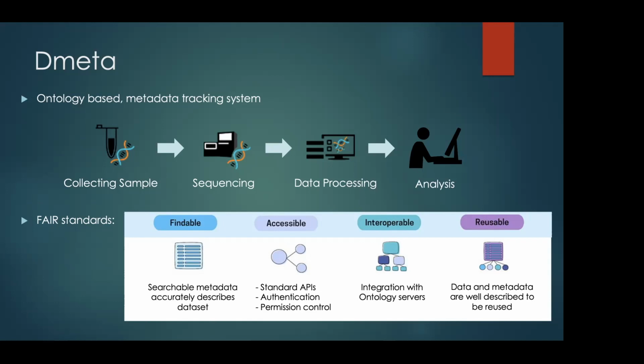But if you don't use the dash, it's still RNA-seq, but the machine cannot understand whether they are the same thing. Machines are not that intelligent yet. You can write some code to handle this, but it's a dangerous process, because RNA-seq with and without the dash might look similar in some cases, but in other cases they might not be.